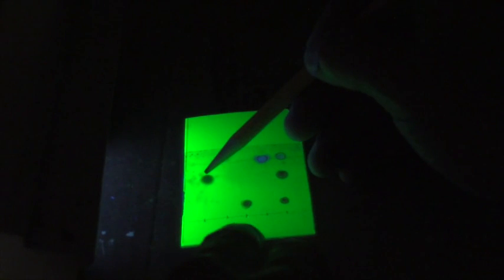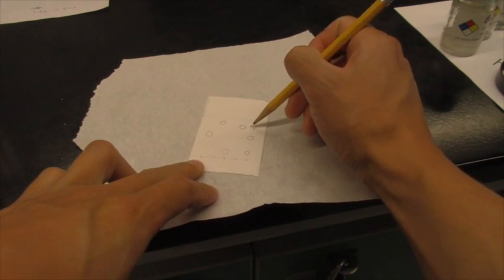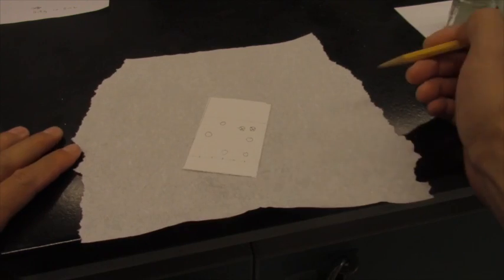So what I'm doing now is circling lightly in pencil the outlines of all of those spots. And I want to do this just so I can simply visualize what's going on outside of the UV light. You might have noticed that 2 of those spots at the top right look a little different. Those spots are fluorescing, and so we can go ahead and mark those. I'm going to mark those with an X through each one of those spots to remind myself that that's what was going on.